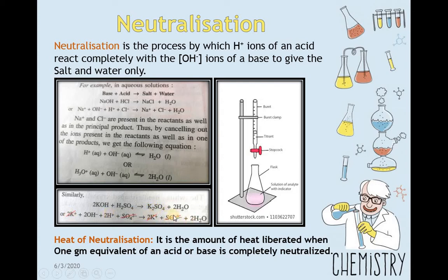Now why is this cut? Because to show that this gives you H2O. This is the process of titration. This is the conical flask. This is called burette. In this conical flask, this is the analyte it is called. You can take, generally you can take sodium hydroxide. Generally bases are taken over here in this conical flask.